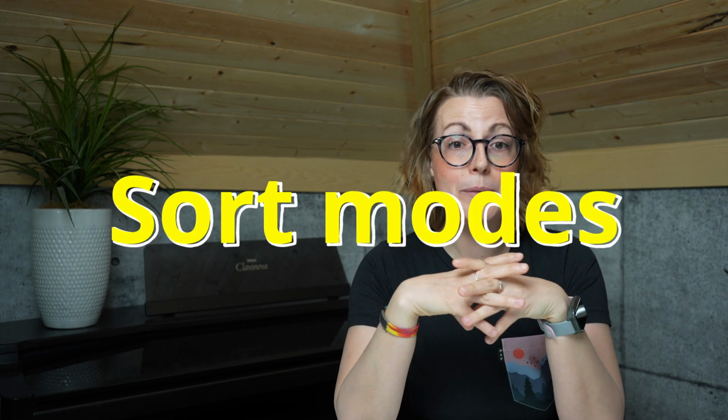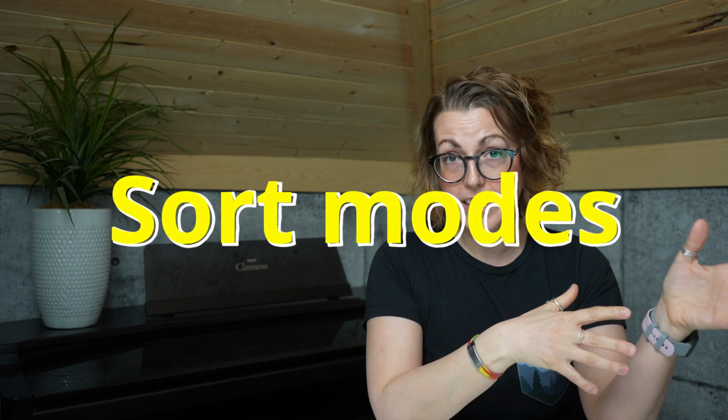First, when you're setting up a sort, there's two important decisions you need to make. The nozzle, which we've already talked about, and the second is what sort mode you want to use. Sort modes can be classified into three major categories: purify, enrich, and single cell. Each of them really live up to their names. It's pretty clear in this case.